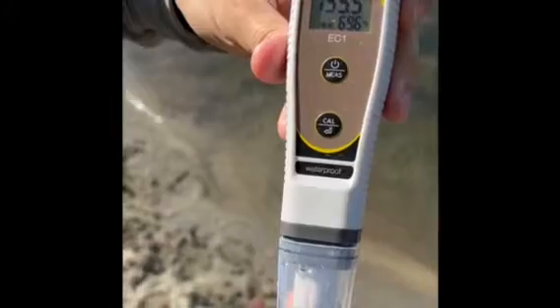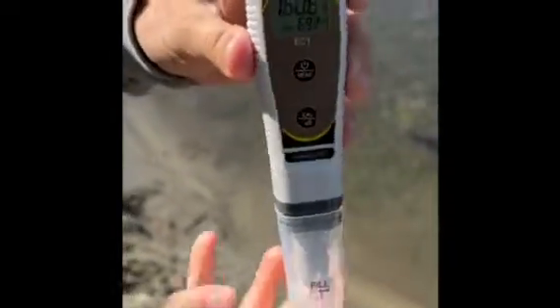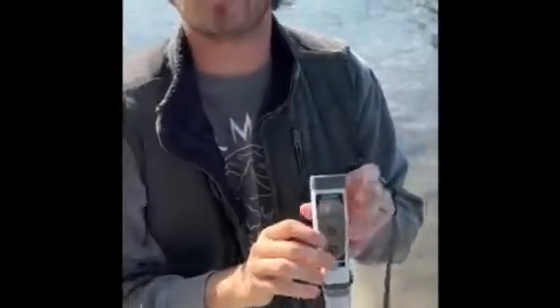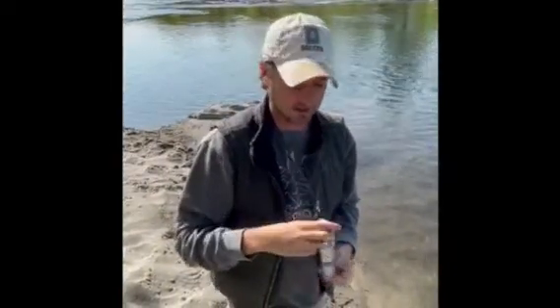You'll see the immediate reading on this is jumping around — you can see it's right at 158, 160 now. So you're going to want to let this sit for a few minutes. What I do when I'm sampling is either wear it so it sits upright and I can continue with the rest of my sampling, or find a shaded place where you can put it down sitting upright where it won't fall down.